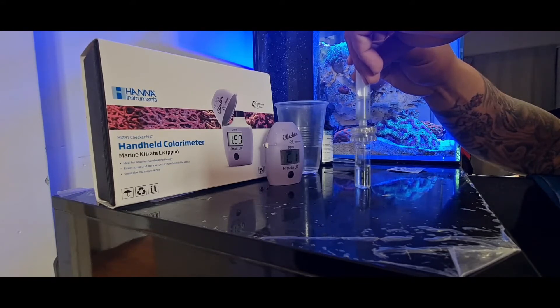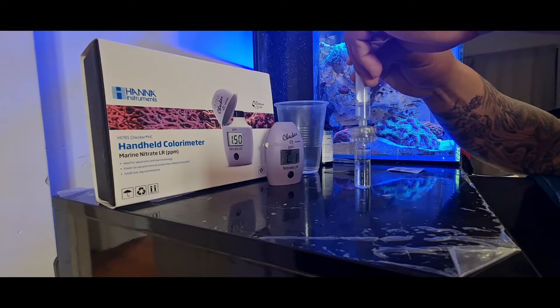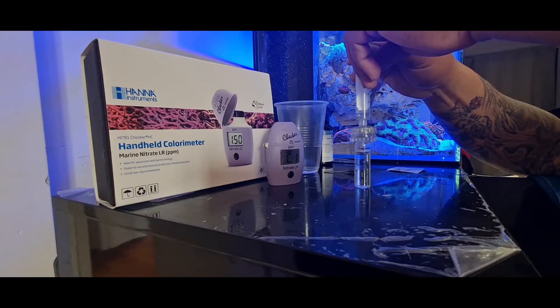What this filter is doing is picking up all the crap that you don't want in there and purifying the water to be clear with no impurities in it. This stuff is mainly from the reagent B — it gets stuck in the filter.